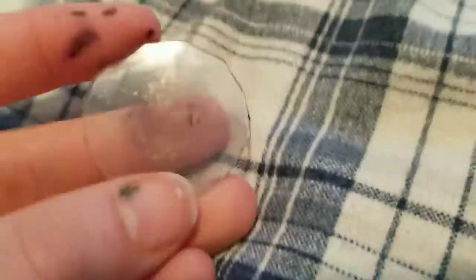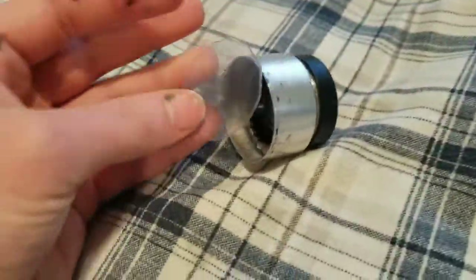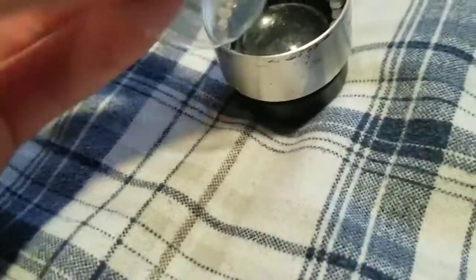However, during my experimentation, I learned that I had a problem. I realized that by adding a blank one of these into here, the polarized light aspect of the microscope wasn't nearly as pronounced, so these little plastic slides were undoing the polarization effect of the microscope.